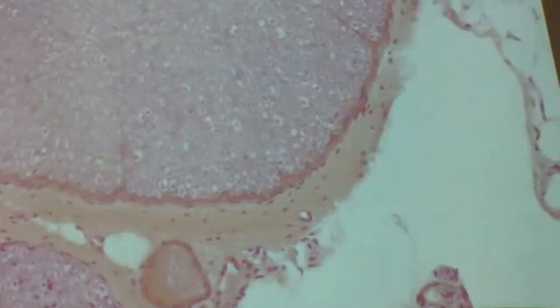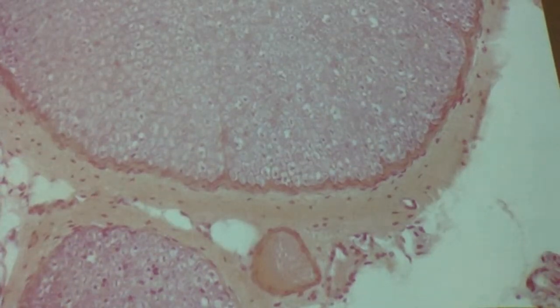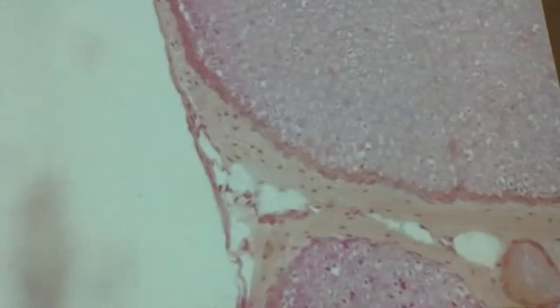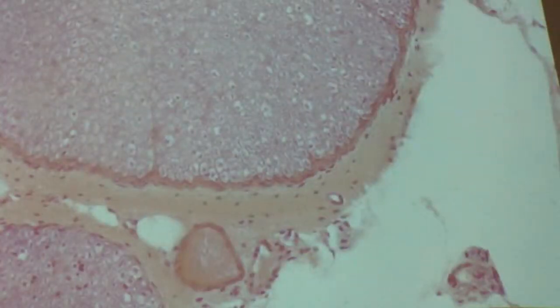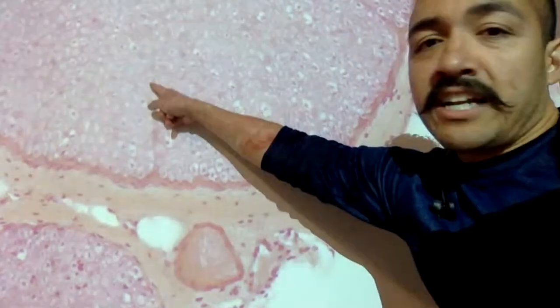Perineurium, let me show you a different part here. The boundaries of this fascicle aren't the most visible here, so I'm going to do my best to point it out. You can see a line here.